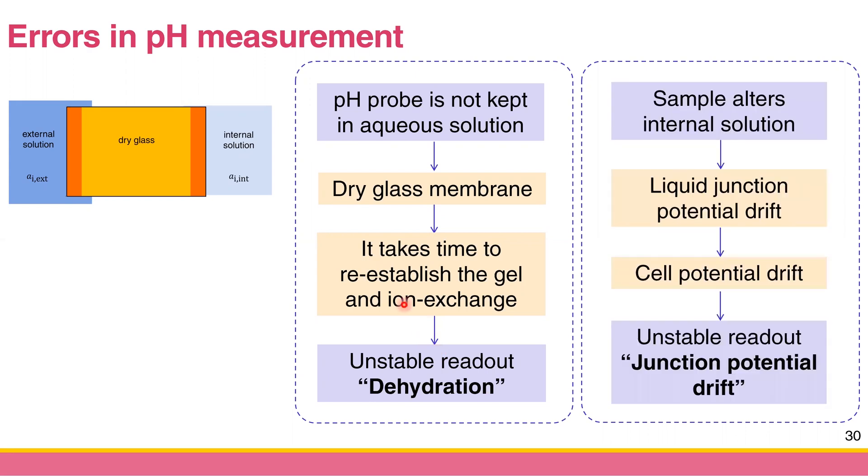The fourth error is junction potential drift. We always assume the internal solution of the pH meter has the same composition all the time. But if the internal solution changes composition, it will change the liquid junction potential, which shifts the cell potential. The readout becomes unstable — this is called junction potential drift.